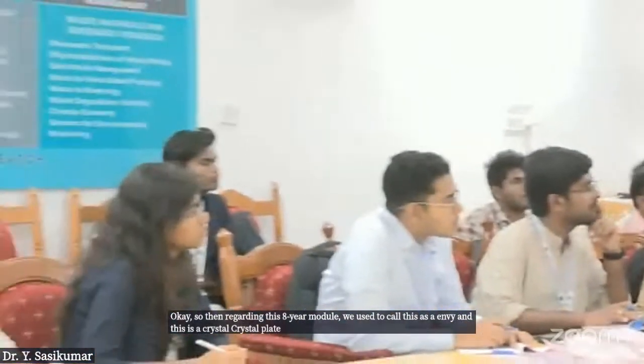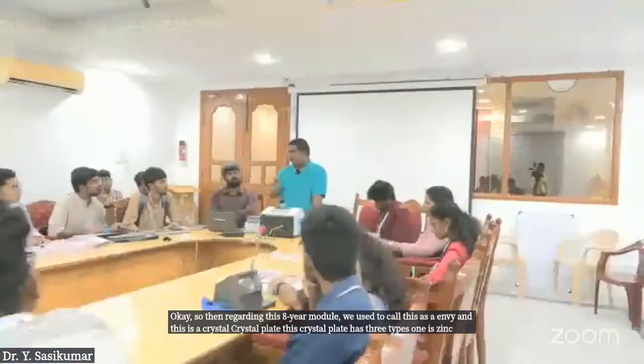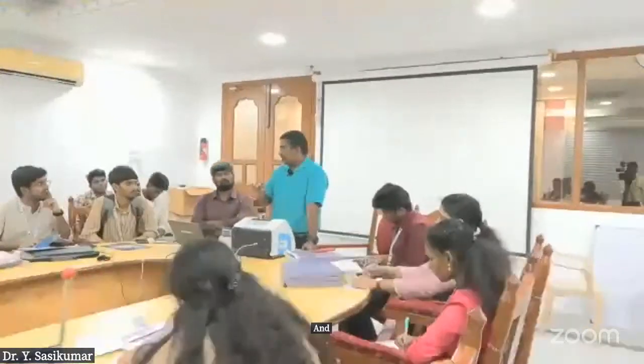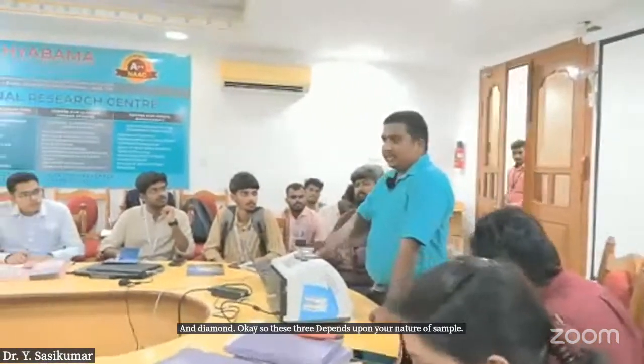This crystal plate has three types: zinc selenide, germanium, and diamond. These three depend upon the nature of your sample, and you have to select accordingly.